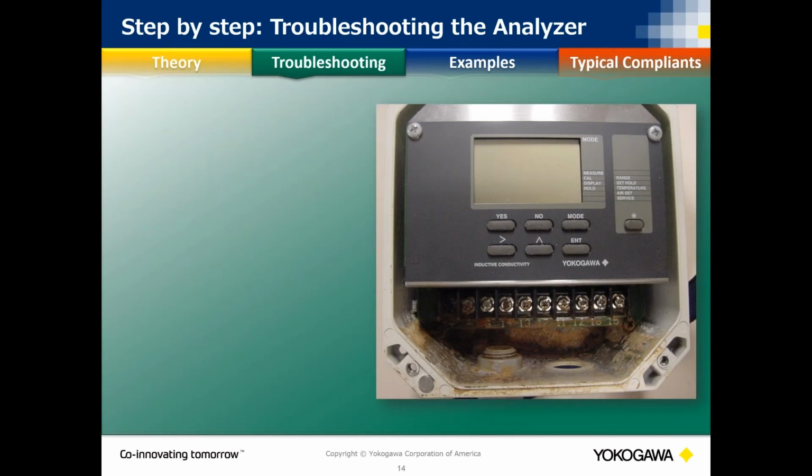So the bulk of where we're going to spend today. These are our steps on what we feel the best process is when we check your analyzer if you're having problems. So the first thing we're going to do is check the data in the analyzer itself. And remember, the photos that I have are just my instrument photos. For copyright issues, I can't use other people's equipment.